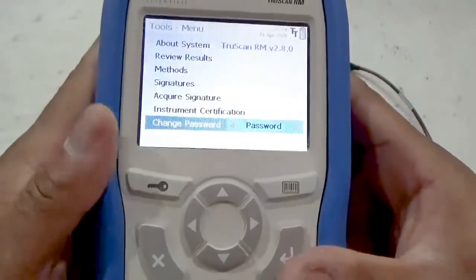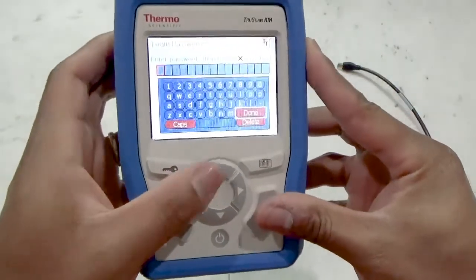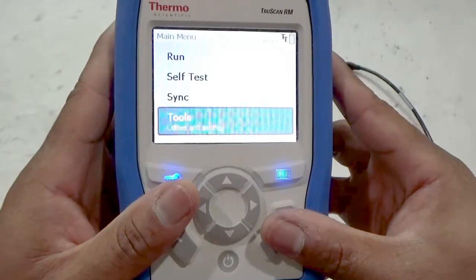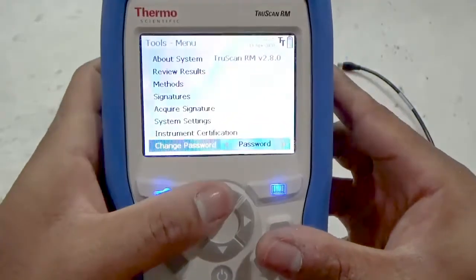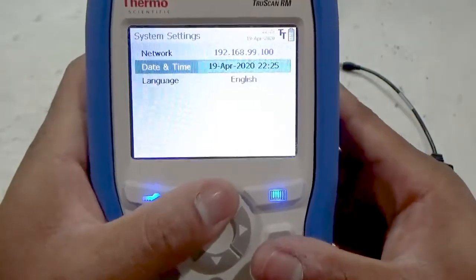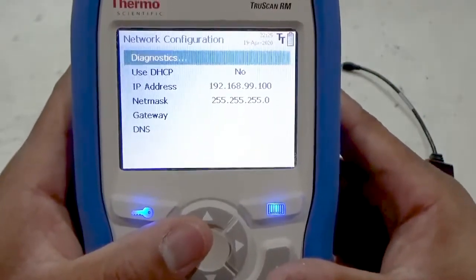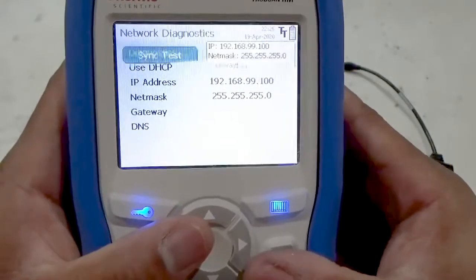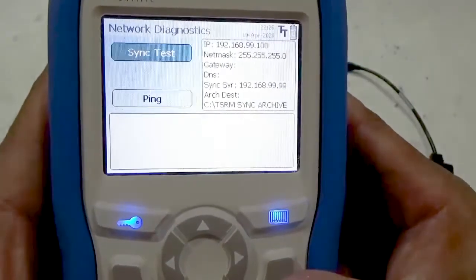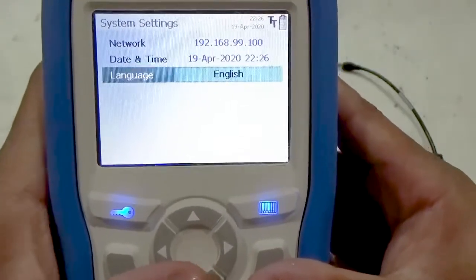Press the logout button and select yes to log out of the instrument. Logging back in as an administrator, we can see that this account level has the same run, self-test, and sync functions of both the operator and developer. The tools menu is also the same as that of the developer, but with one additional function: system settings. System settings allows the administrator to set up network connectivity for the analyzer and set either a static IP address or use DHCP. The administrator may also perform network diagnostics to troubleshoot connectivity issues, set the date and time of the instrument, and change the language displayed.